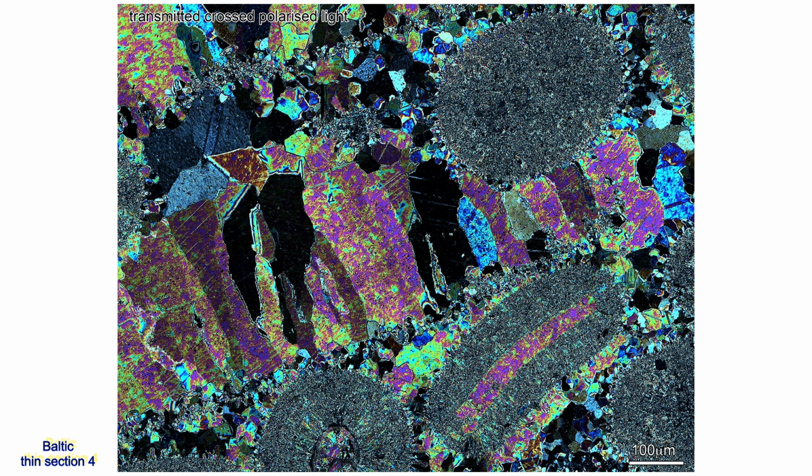emphasizes a series of homoaxial columnar crystals centered on the bivalve's prismatic crystals. Cement A epitaxially attached to these crystals, growing away from the prismatic crystals in opposite directions.